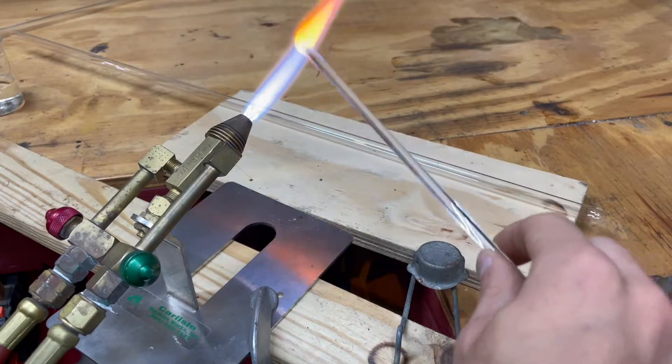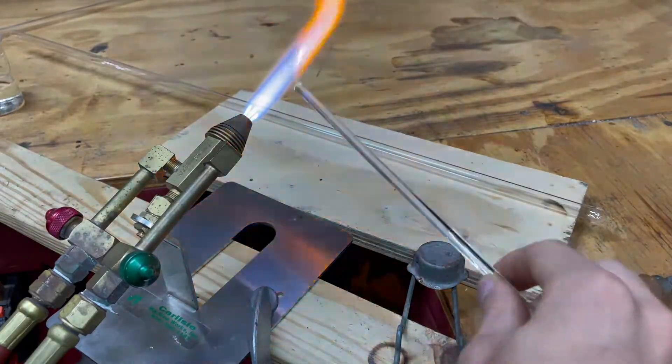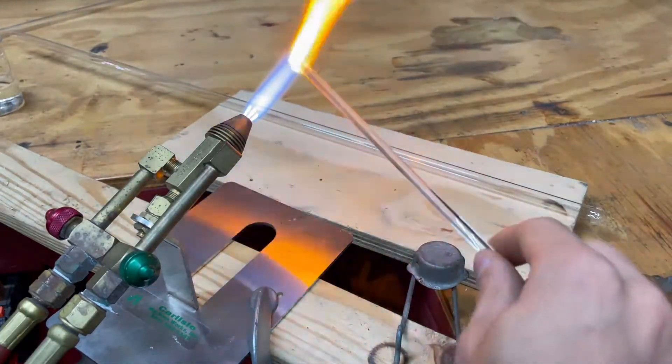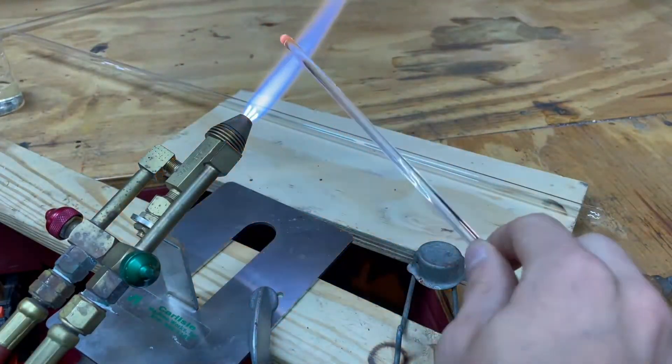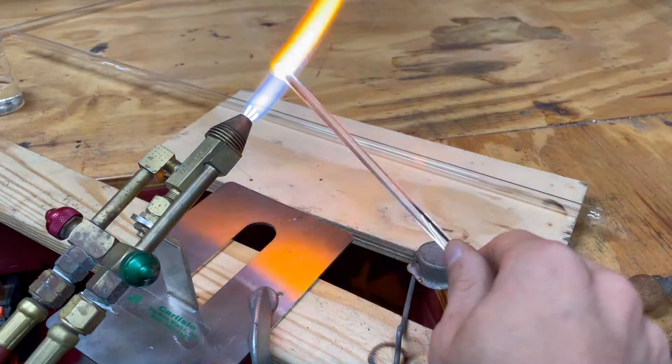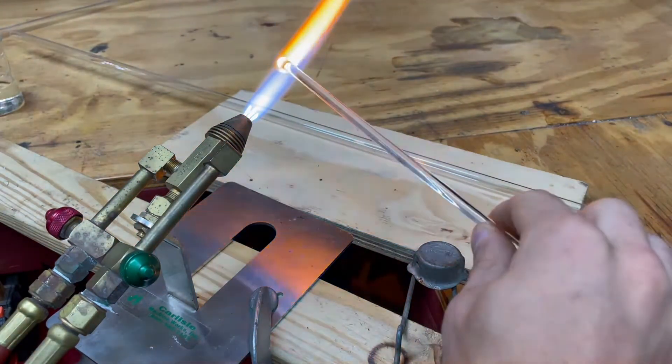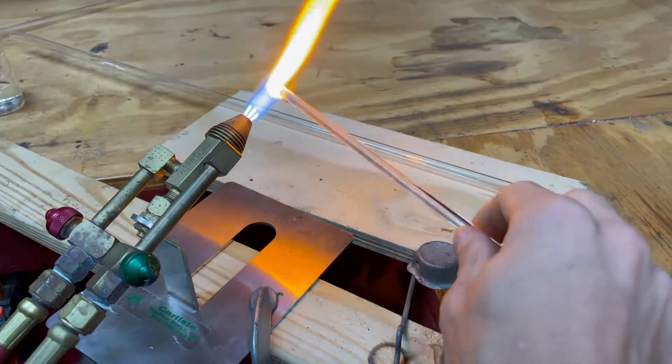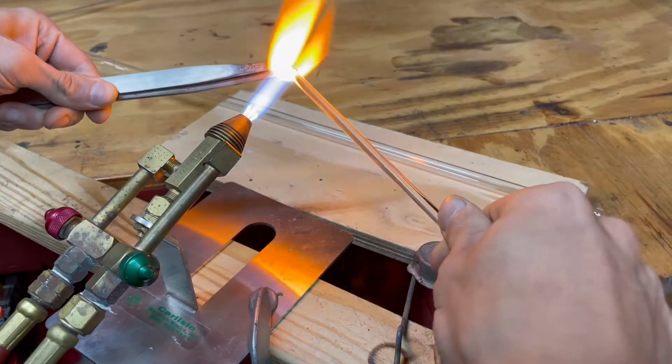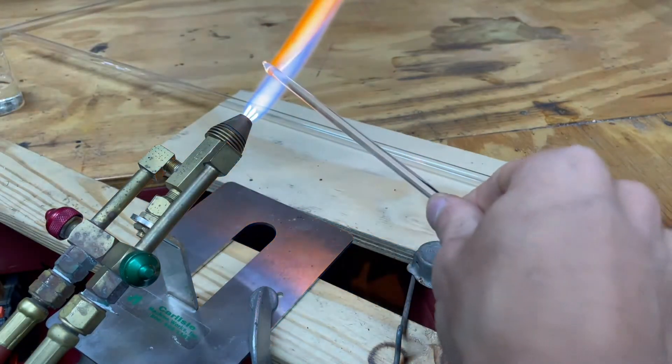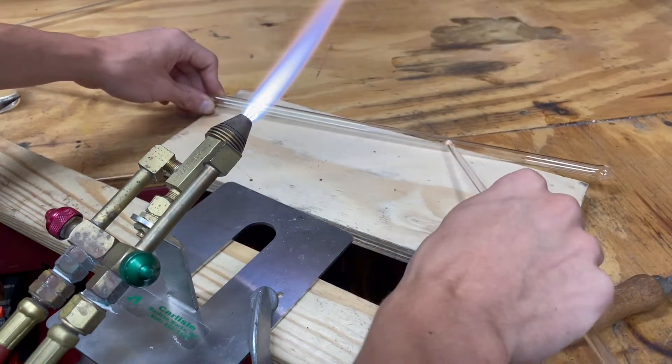As you do it you're going to want to move it closer to the working area of the torch. And you can see the sodium flare started to occur which means the glass is starting to melt. Now you can slowly rotate it. Now we got a large bead forming and we don't really need that so we can pull that off with the torch tips.